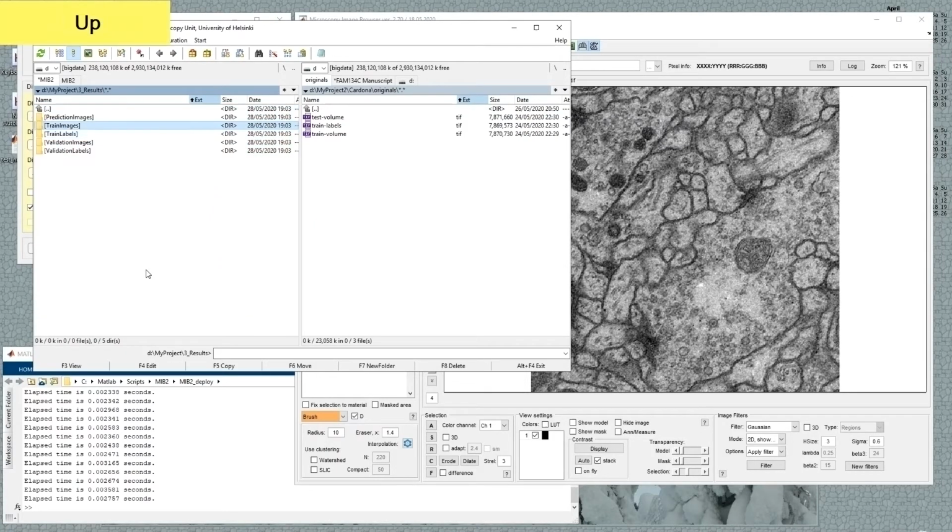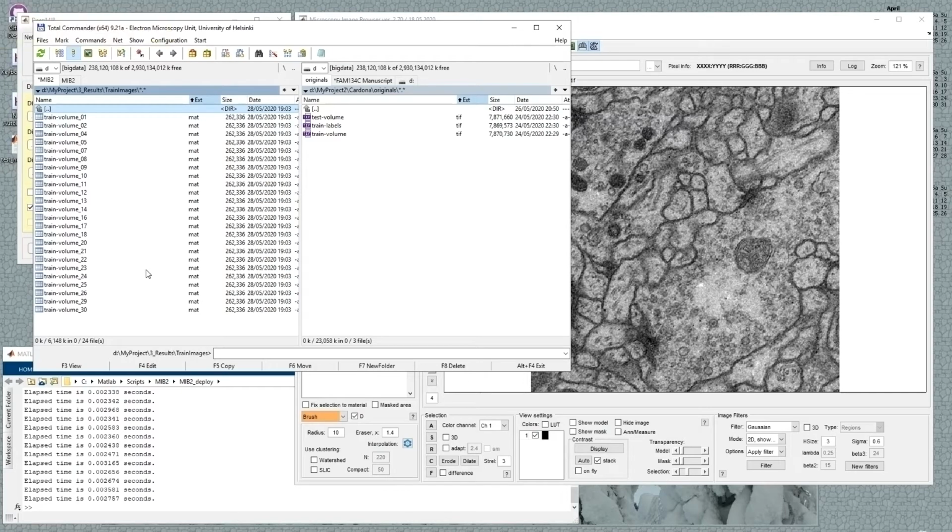The images here are randomly split from the original dataset. So you can see that this is 1, 2, 4, 5, 7, 8, 9, 10, 11, 12, 13, 14, 16. They are randomly split, but they split in the same order. If I do the splitting again, the order will be the same. The idea is that it allows better tweaking of the procedure with different parameters.